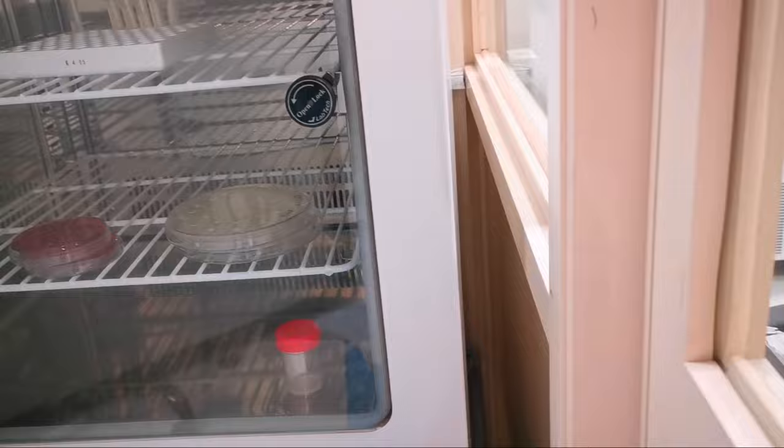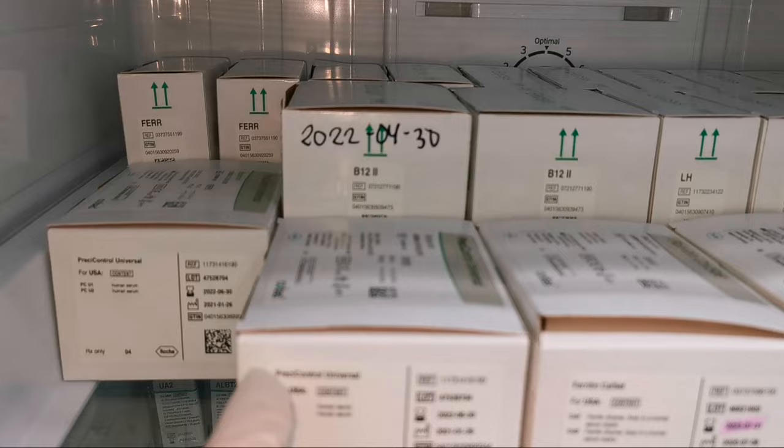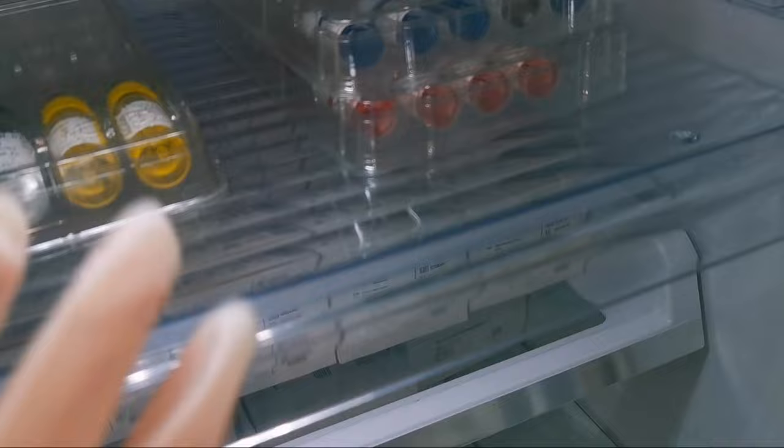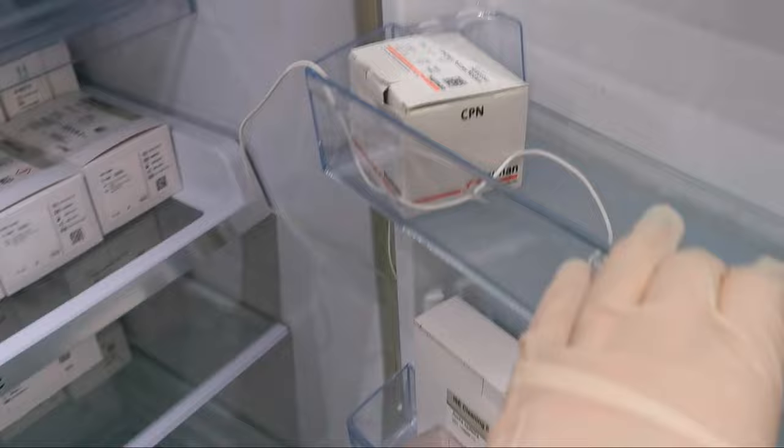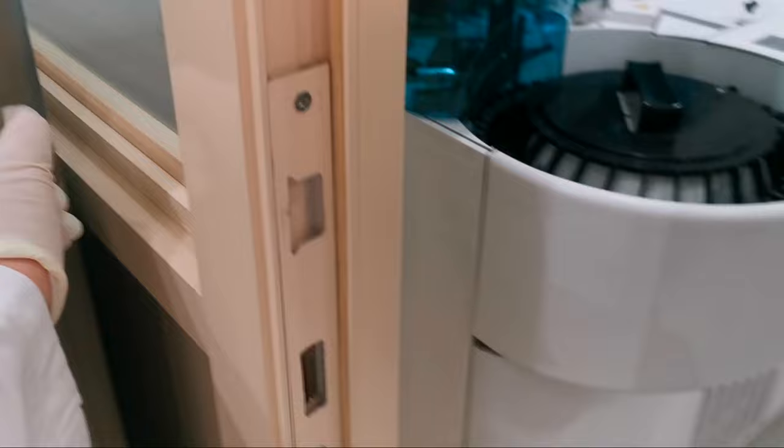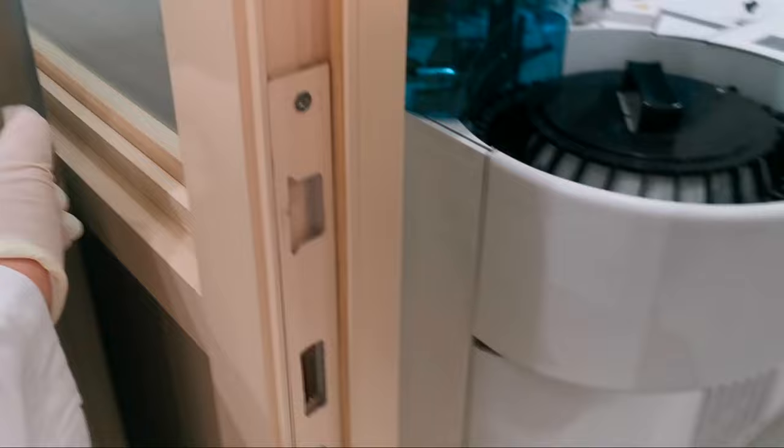Incubator where we grow bacteria. Let's open the refrigerator. Cobas reagents and calibrator. Antiserum and febrile antigens. Refrigerator for sample storage.